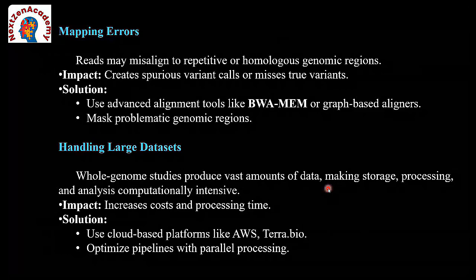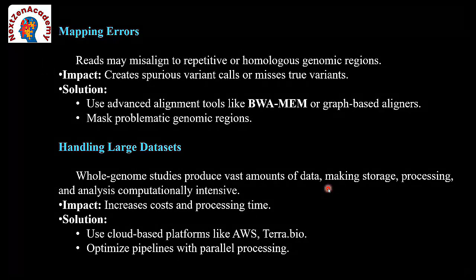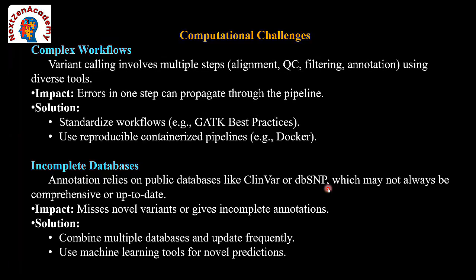Reproductive health, specifically pre-implantation genetic testing, is used to identify any pathogenic variants present in the embryo. It is a technical algorithm to perform, with replicate sequencing to confirm the findings and check whether we have done it properly or not. There may be a chance of low sequencing depth.